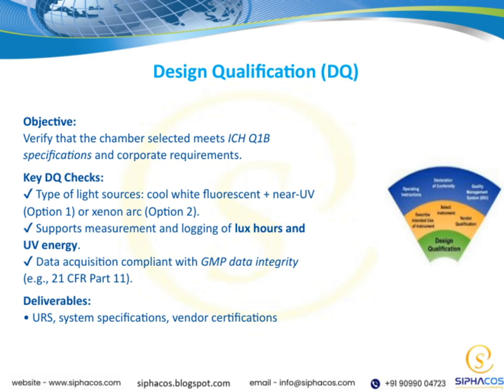This guarantees that the data collected is secure, accurate, and meets regulatory requirements. As for deliverables, we expect to have a comprehensive user requirements specification, or URS, along with detailed system specifications. Additionally, vendor certifications are essential to confirm that all components meet the necessary standards and specifications. In summary, the design qualification helps us systematically verify that the chamber's design aligns with both regulatory standards and internal quality expectations, setting the foundation for successful validation and operation.